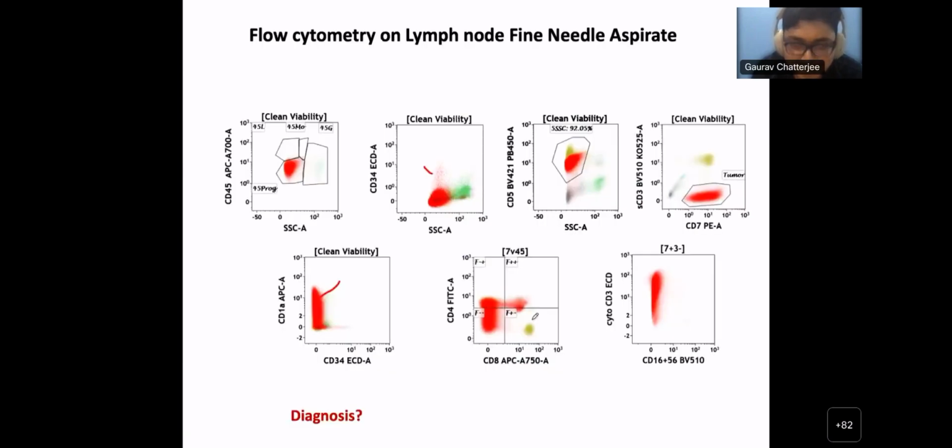Right. Now Ankit, in this case, remember there was some eosinophilia as well. So how do you correlate all the findings? Are you going to label this T lymphoblastic lymphoma and stop there, or do you want to do anything else? Ayushi, this is your case. We have established the diagnosis of T lymphoblastic lymphoma. But remember the patient had only very small blasts in peripheral blood, and the predominant finding was eosinophilia. So are we going to stop here, or anything else you want to do? Maybe we would like to check whether there is bone marrow involvement or not.